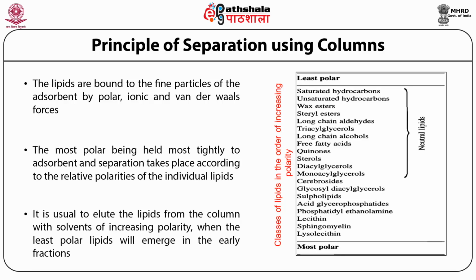The most polar molecule will be held most tightly to the adsorbent, and the separation would take place according to the relative polarities of the individual lipids.